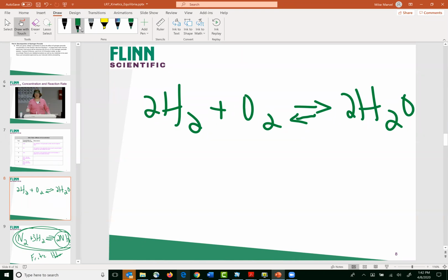Got it. Thanks for explaining that further. Sure. This next question is kind of two parts. It's interesting. One of the students was observing closely. One of the experiments that looked like the hydrogen peroxide was reacting with smoking. What exactly was that? Oh yeah.